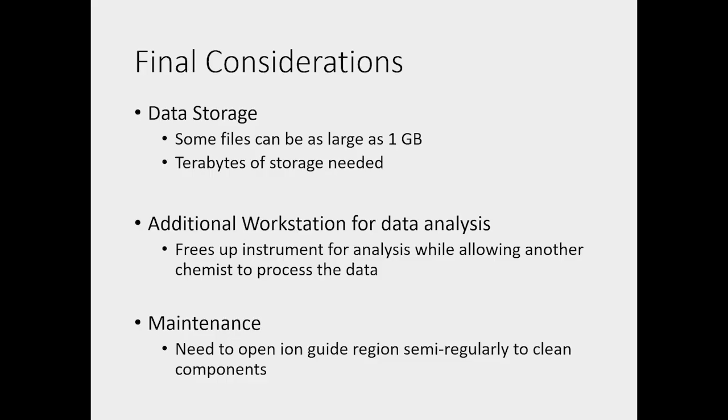The process data is smaller. So if you're storing process data in your LIMS system or something, it might not be as overwhelming. But the raw data files can be a lot to back up. The additional workstation, you may want to consider it.